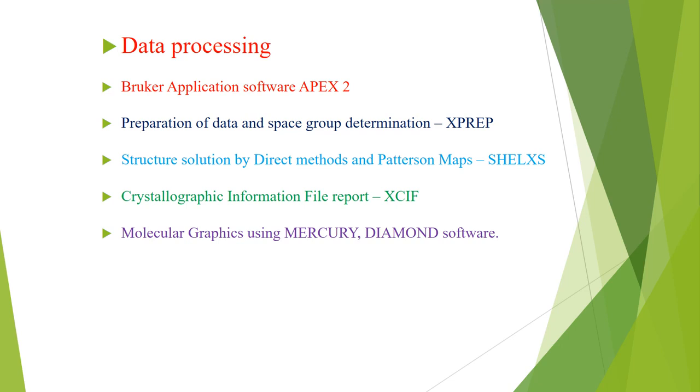These are known as Bruker application software, APEX2, and other software used, that is SHELXTL.